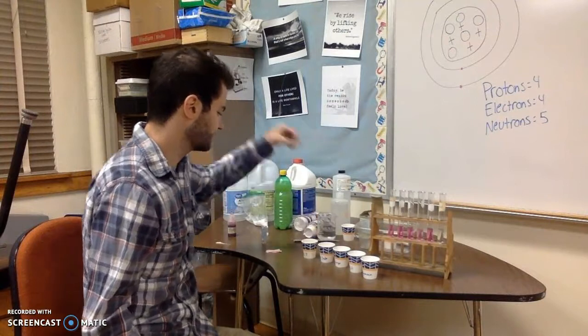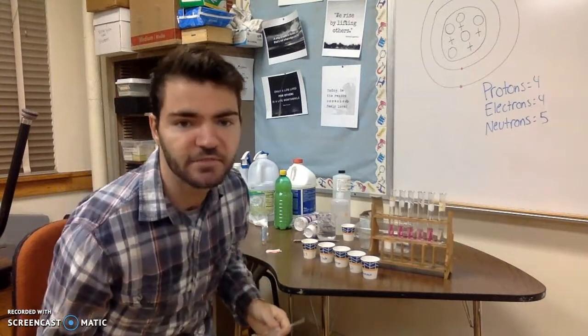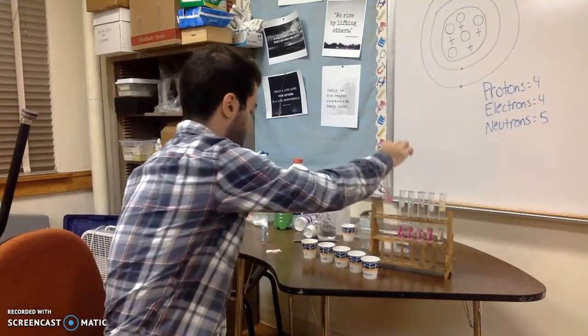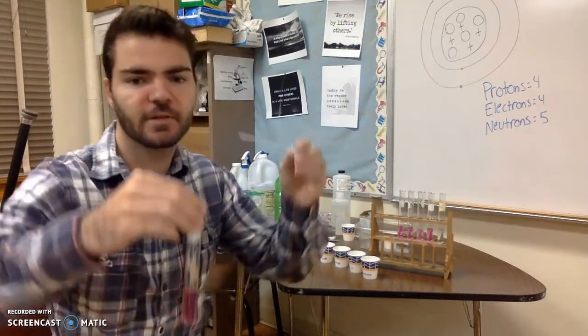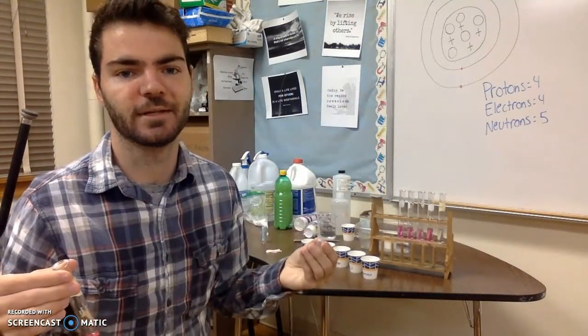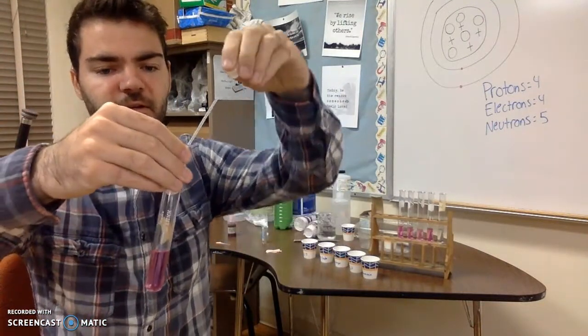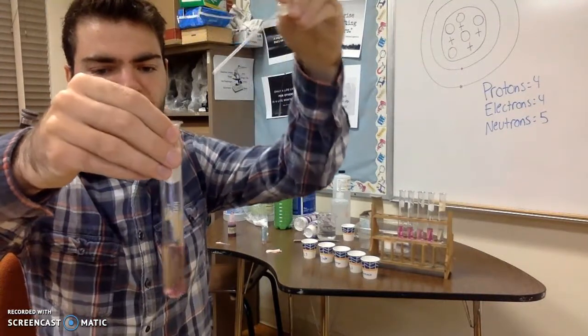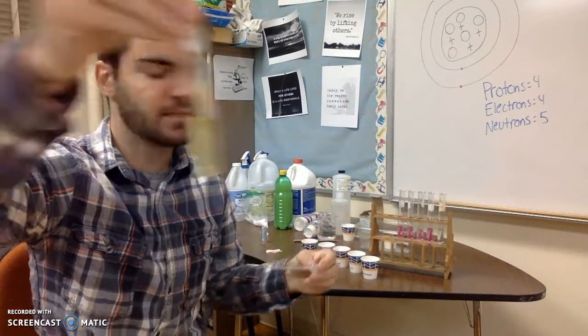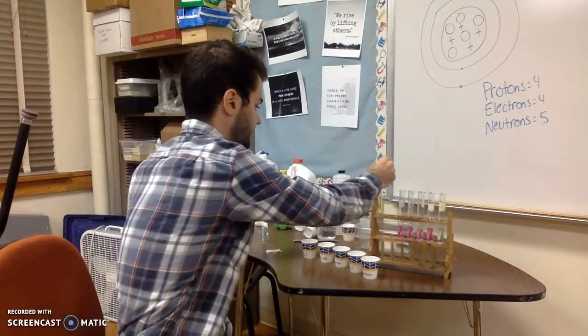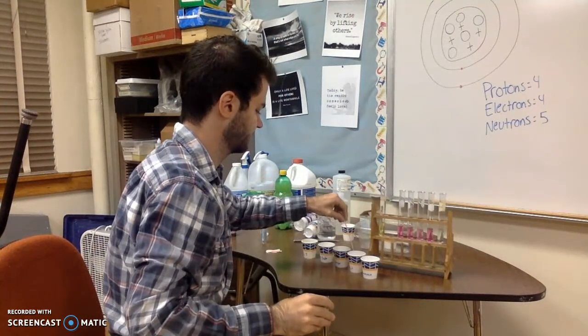So what I'm going to do, I'm going to take my pipette. I'm going to put a few drops in of each solution, and we'll see if there's a color change. I'll bring these up here as we go. So first one is lemon juice. This might be a little more clear than the red litmus paper test. So you might want to use this test to help you answer your questions instead. So lemon juice. Is lemon juice an acid? I'm going to put it out.